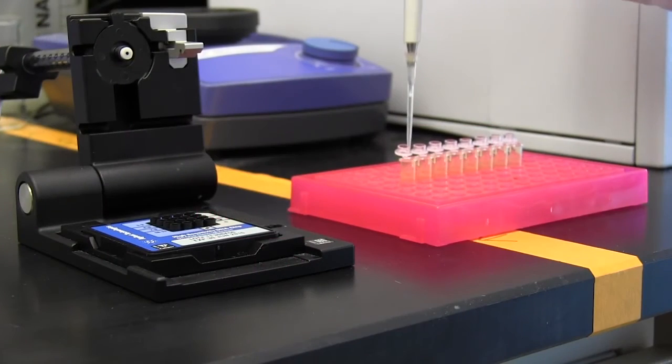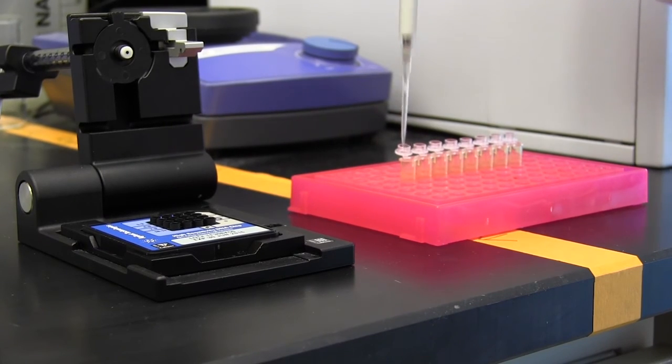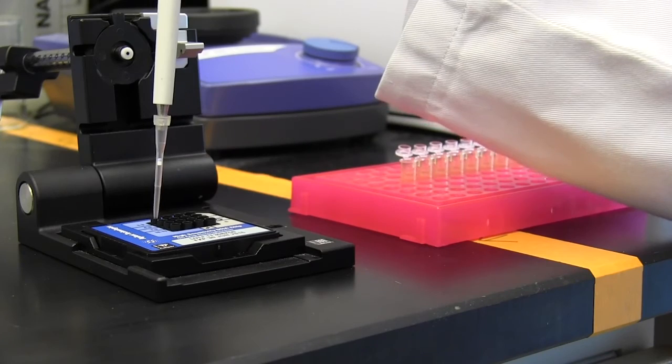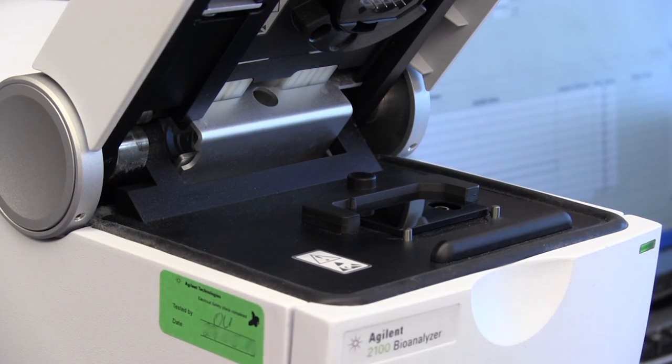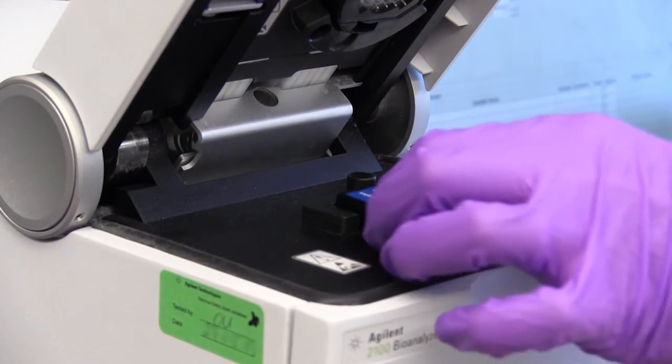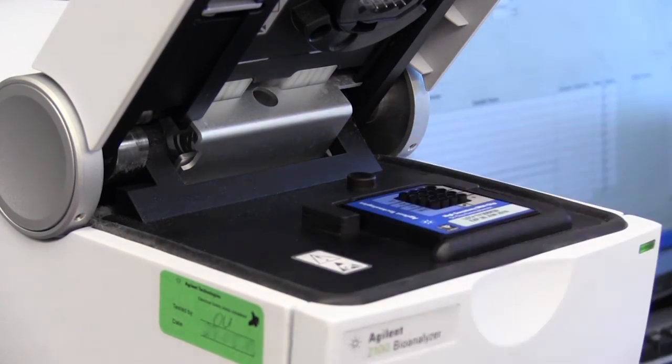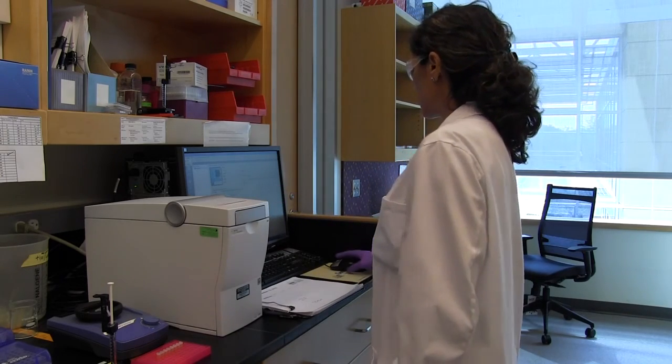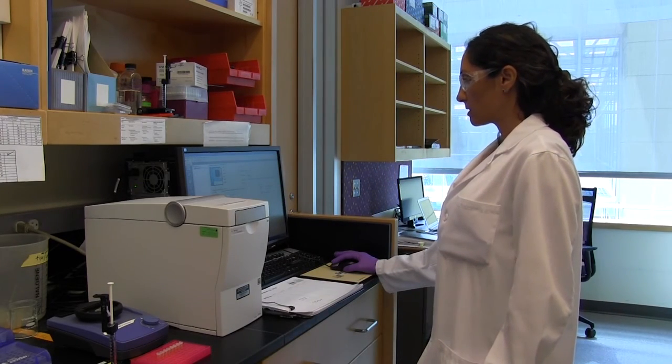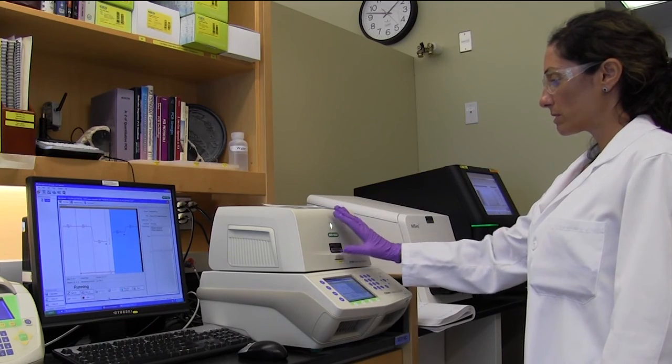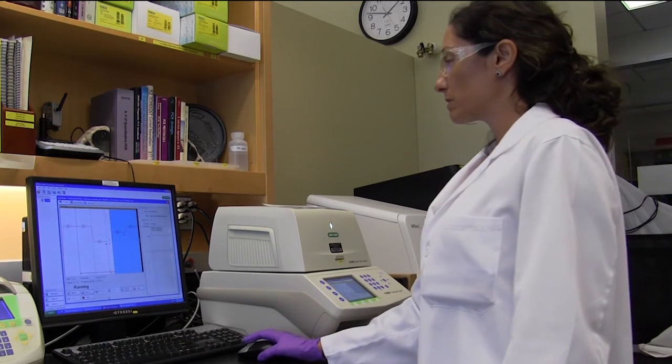You can confirm the size distribution of the library by diluting one microliter of the library five-fold with 10 millimolar Tris hydrochloride or 0.1X TE buffer and running it on a bioanalyzer using the high sensitivity chip. The final library can be quantitated using qPCR-based methods such as the NEBNext library quant kit or using electrophoretic methods like the bioanalyzer.